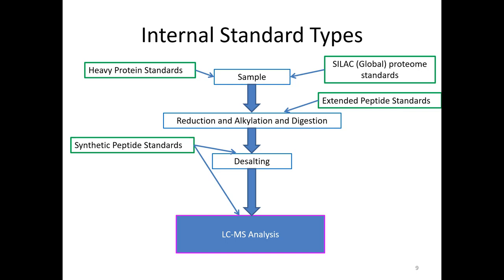+3, for the same peptide, will be down here, and it might look like this, where this is the monoisotopic. And so this is an important thing. This is partly what Skyline does to match precursor isotopic pattern. This can be theoretically calculated.